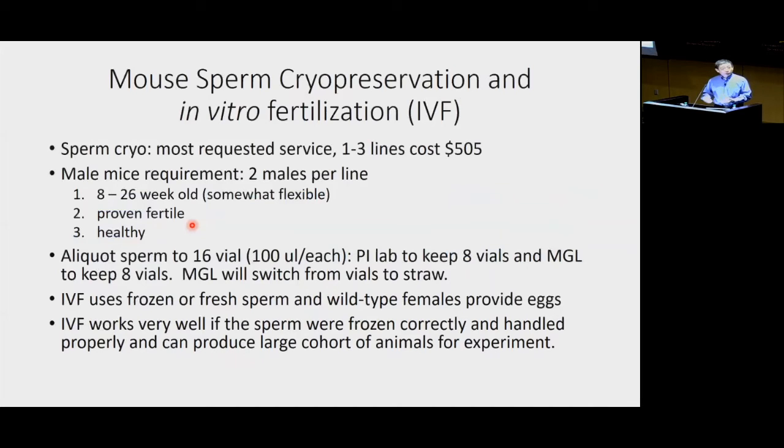But also, you may receive sperm that was damaged in the handling process or whatever, or maybe the sperm was cryoed many years ago, and the procedure is different from nowadays. In the past, I don't know, 10 years, 5 years, there's been some improvement in the cryo procedure. If your sperm was made 20 years ago, it may work, may not. So you have to try it, and then you will know.